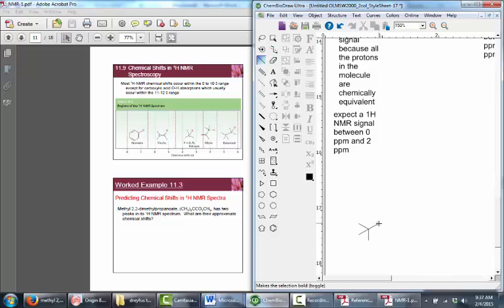So those three guys, and then here, this carbon here is going to have a carbonyl on it. Hold on, let's draw what these guys actually look like. And the question now is, the first question is, if I look at a molecule like this, how many different proton signals am I going to see?